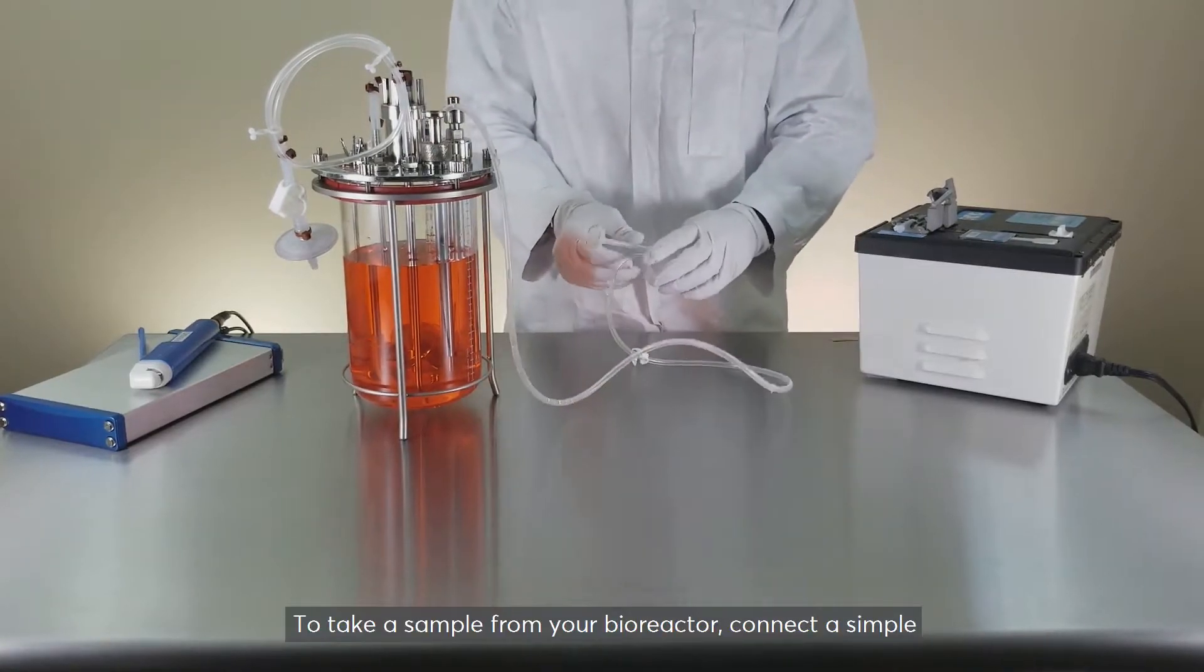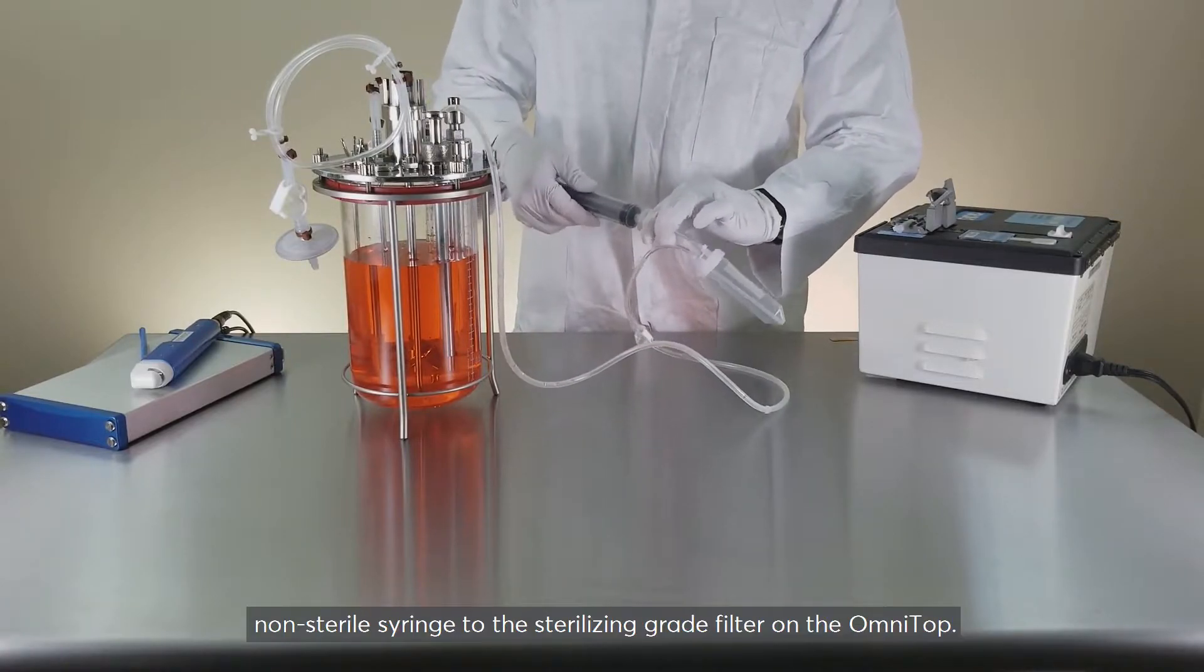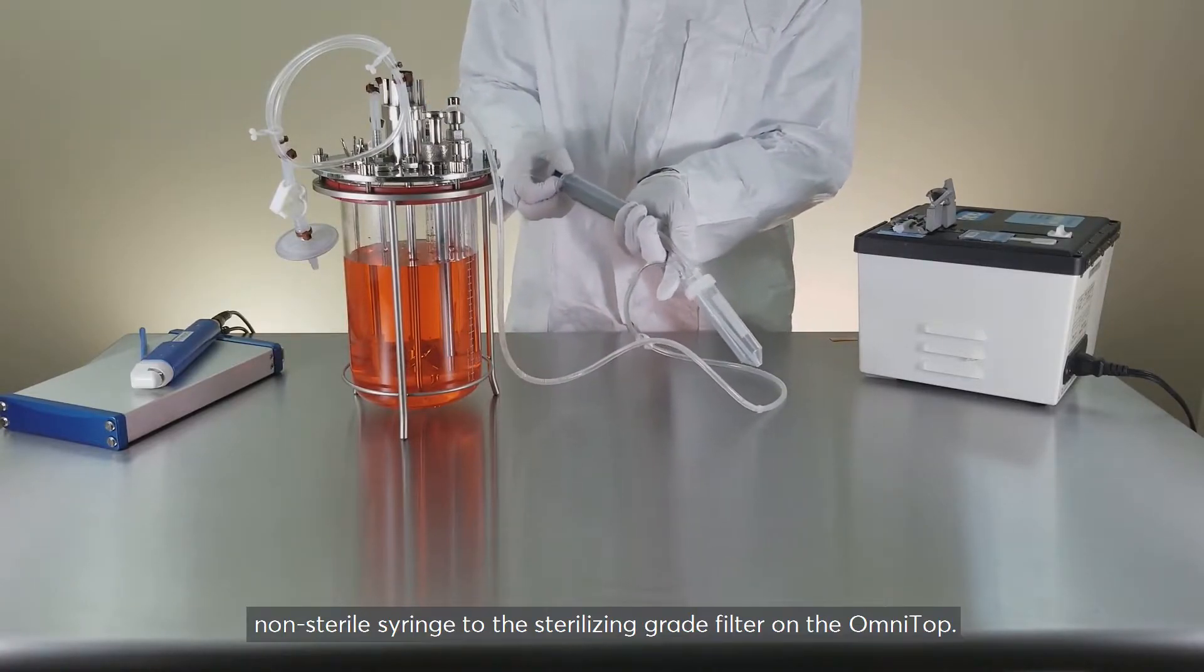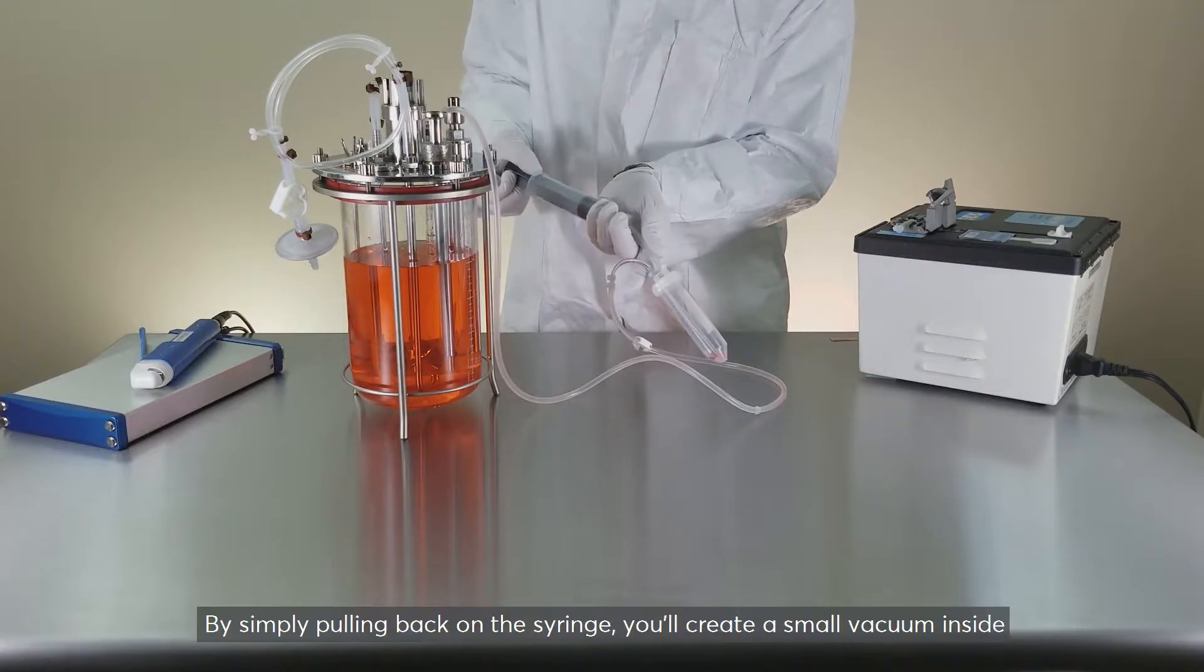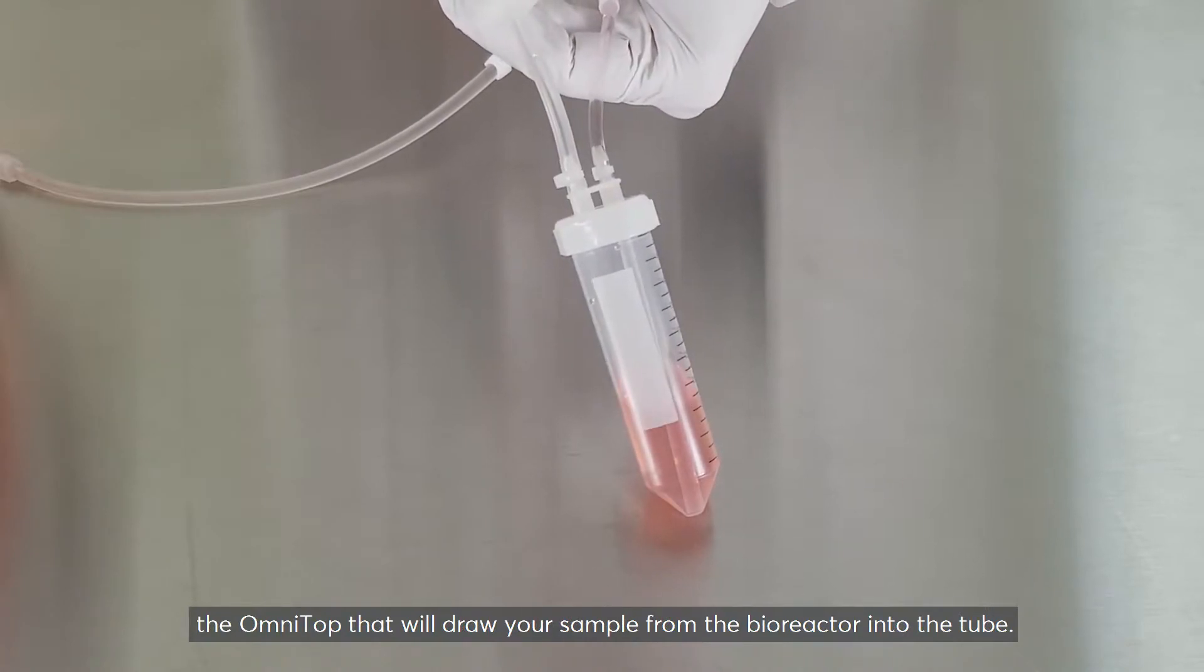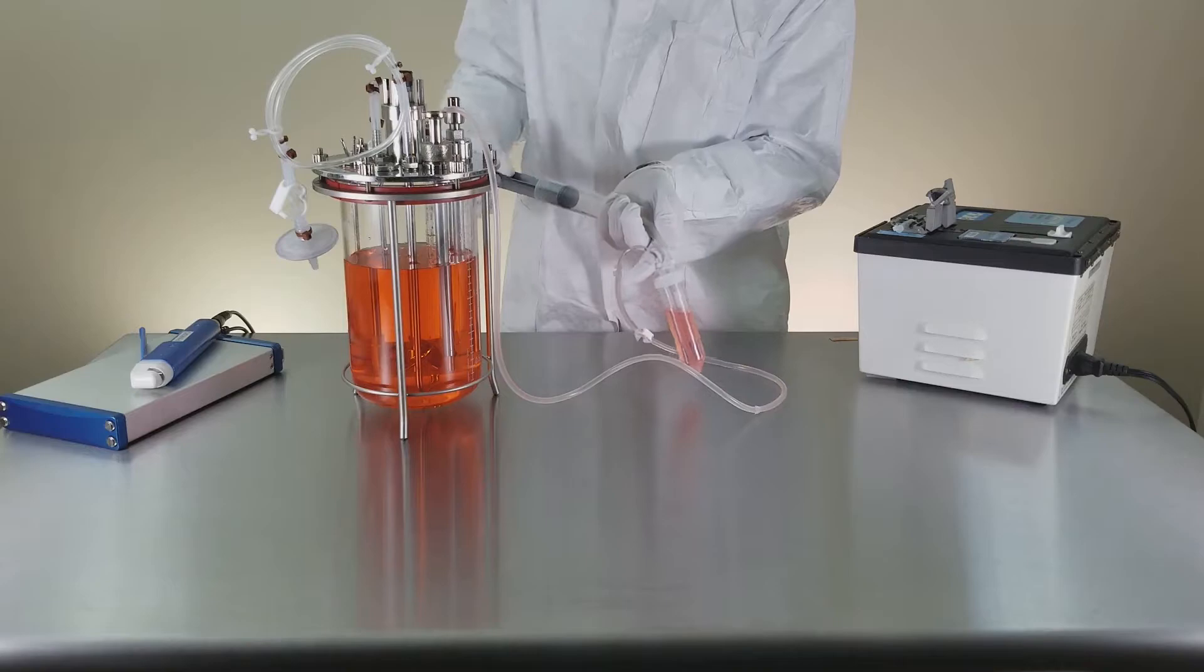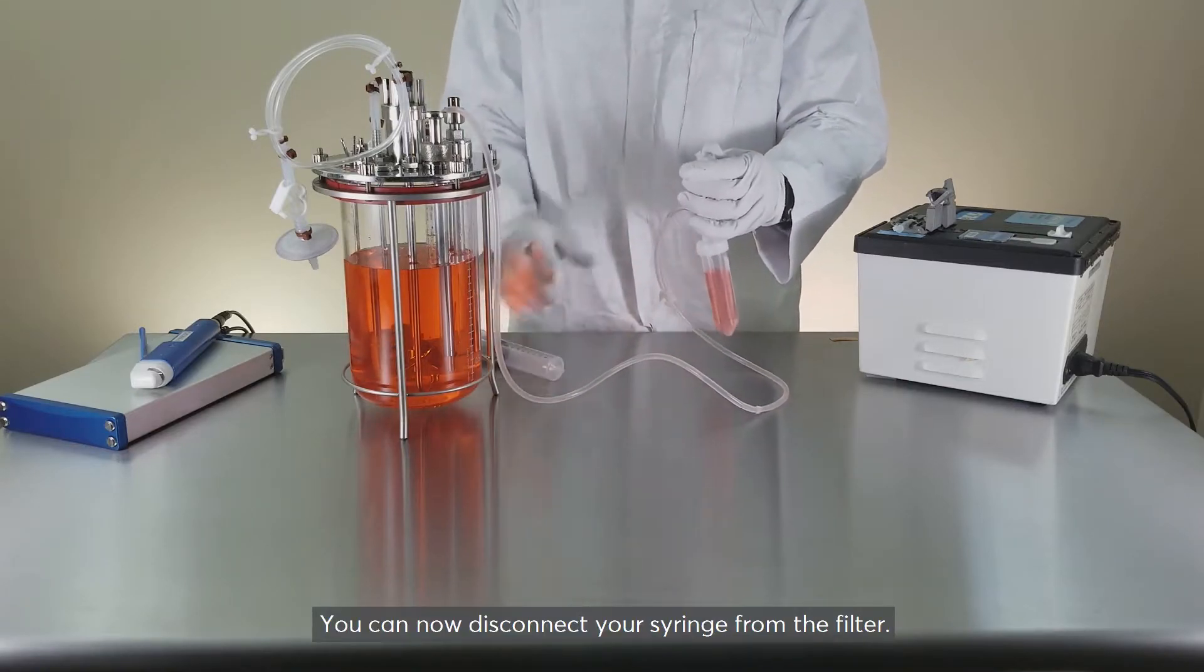To take a sample from your bioreactor, connect a simple non-sterile syringe to the sterilizing grade filter on the OmniTop. By simply pulling back on the syringe, you'll create a small vacuum inside the OmniTop that will draw your sample from the bioreactor into the tube. You can now disconnect your syringe from the filter.